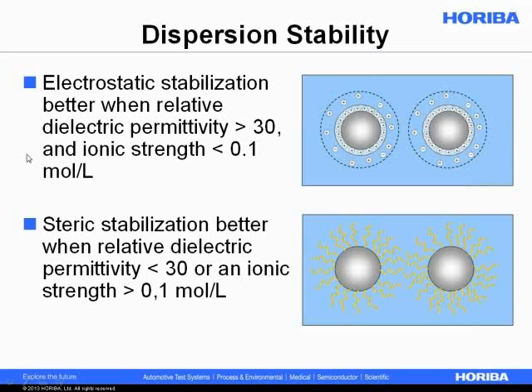So ionic strength, well, we really just have to know the concentration of ions and what kind of ions they are. So remember, for ionic strength you do a summation of the concentration of the ions, but then you take the charge number and that's squared. So the charge number is very important when trying to estimate the ionic strength of your sample.